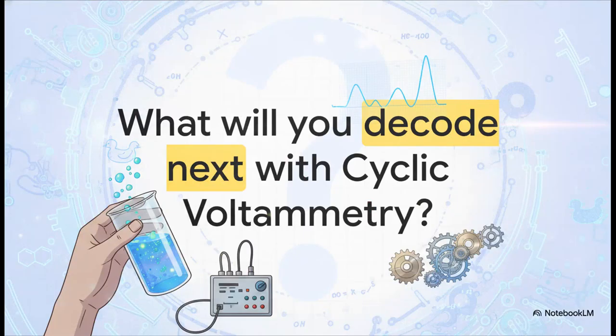So as we wrap up this explainer, I want to challenge you. Think about how you can apply the simple sweep of a voltage dial to uncover the hidden chemical kinetics in your own work. You now know the lab setup, the crucial difference between a one-way sweep and a full cycle, why that famous duck shape exists, and how to manipulate time itself to reveal reaction speeds. The tools are right here in your hands.